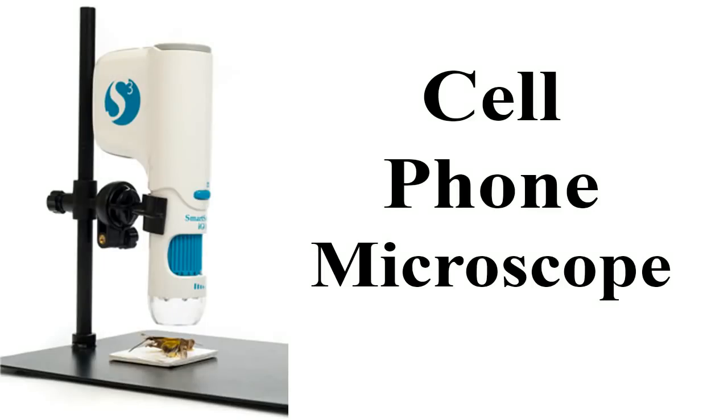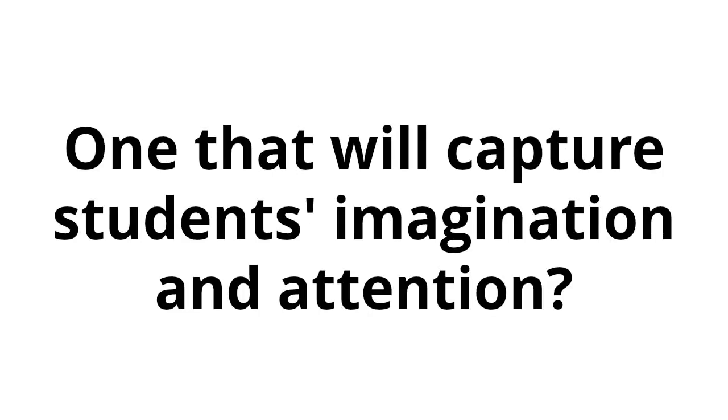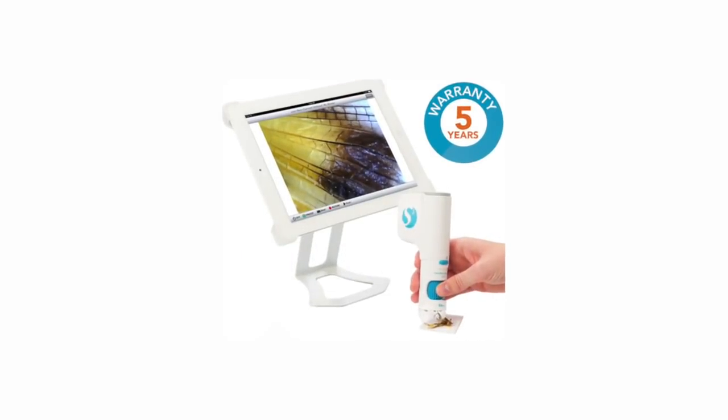Cell Phone Microscope. Looking for a great cell phone microscope? One that will capture students' imagination and attention? The only thing better than a smart microscope that gets students excited and keeps them engaged is a smart microscope that gets students excited, keeps them engaged, and has wireless technology that's compatible with iOS and Android mobile devices. That's exactly what you get with the Smart Microscope iGo 2 by Smart School Systems.